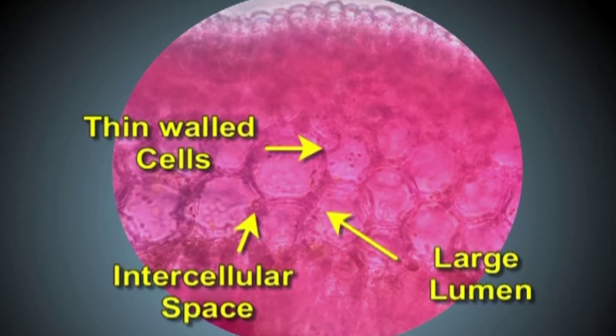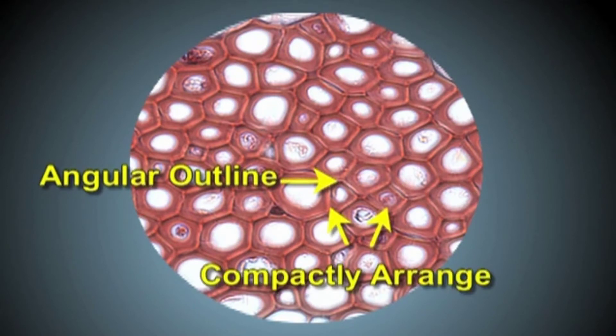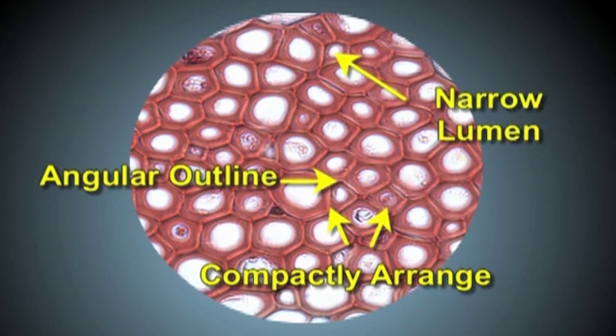In contrast to this, we have thick-walled cells as well in the hypodermis, and some cells of the cortex are also thick-walled. These thick-walled cells have an angular outline, they are compactly arranged, they do not have intercellular spaces, and they have a narrow lumen. Such thick-walled cells with these characteristics are called sclerenchyma.